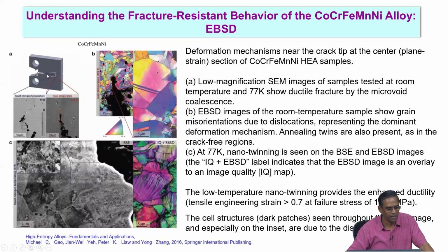It's called a fatigue pre-crack. It is done by fatigue loading, so a naturally grown crack is measured to the predetermined length, and then finally you pull them. Once the natural crack has grown to the predetermined length, you pull the sample and look at the load versus displacement curve. From there you calculate the toughness. That is a part of a mechanical behavior course you would have studied.